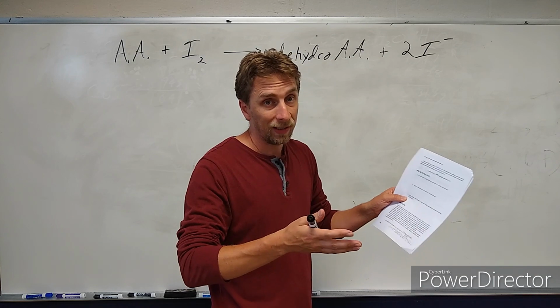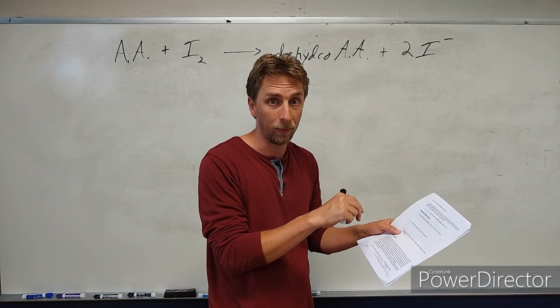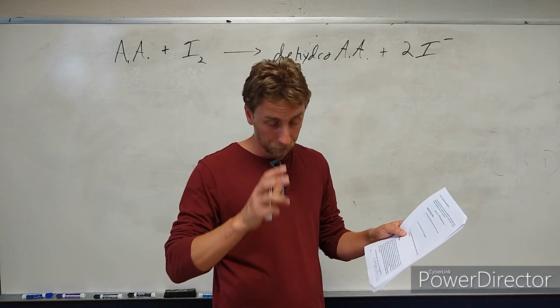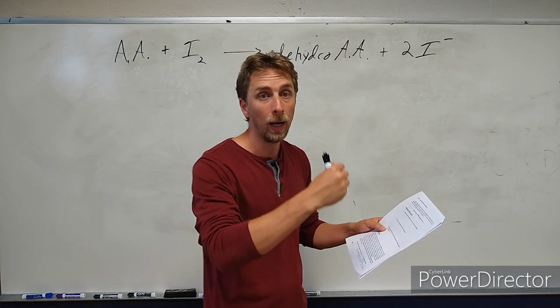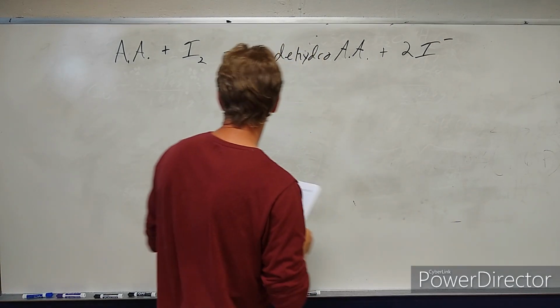The math for this lab is much less involved than the previous 2 labs, so that's good news for those of you who might not like all that math. You just have a very easy calculation compared to those other ones. It's just 1 step is the way it's broken down. But I'm going to show you a little bit of background where that 1-step calculation comes from real quickly here.